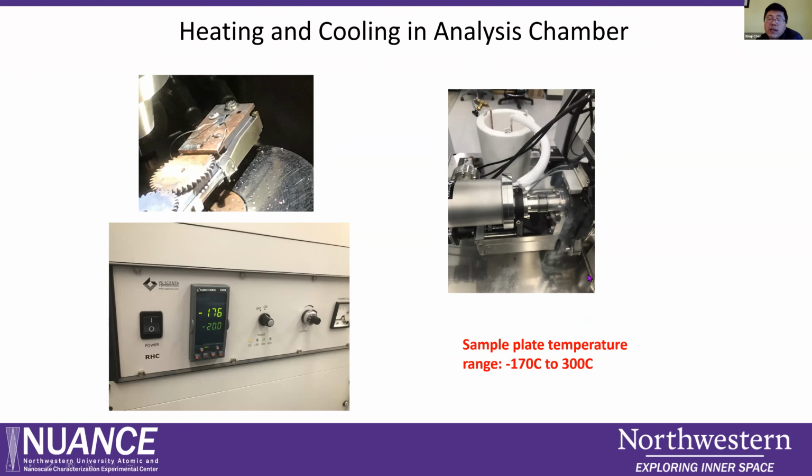In this talk I didn't put up spectra, but we also have a UV source, so we can also do UPS analysis, and others like ISS, which is not often used. If somebody is interested, we can talk offline.